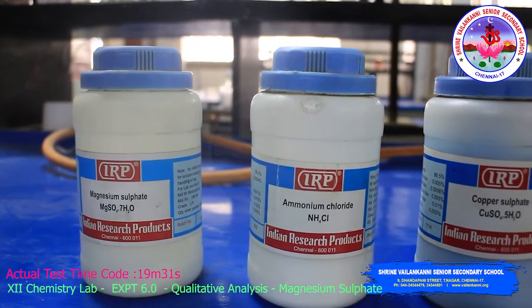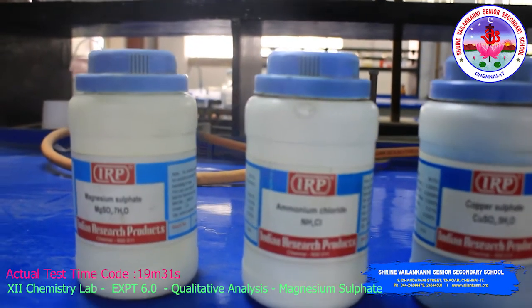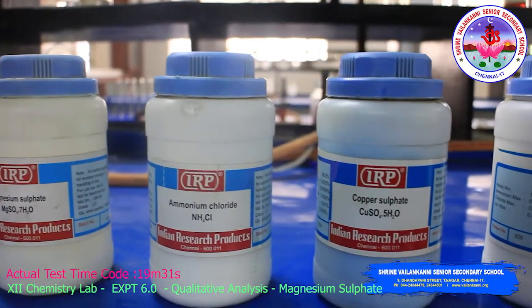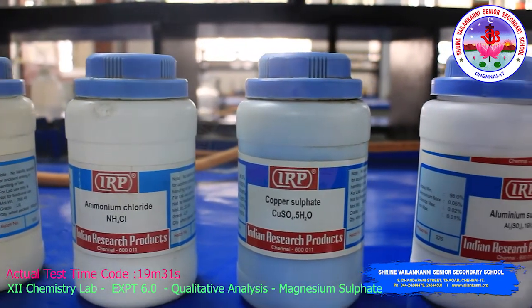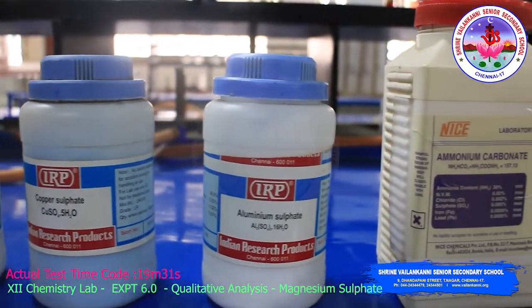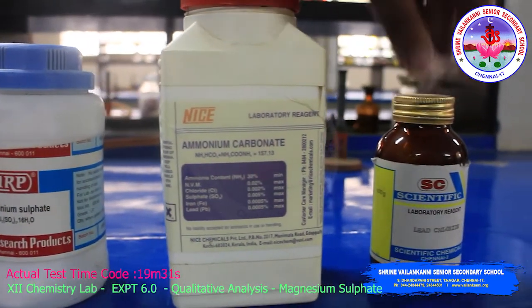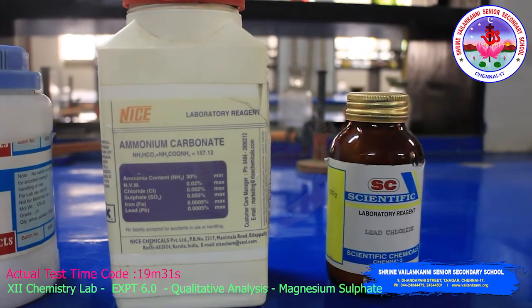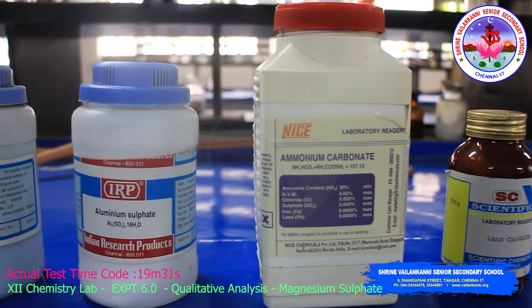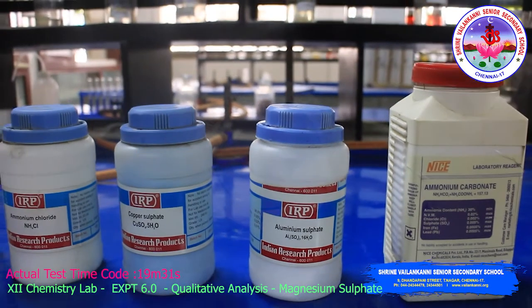Here I will show you the salts we are going to do this year: magnesium sulfate, ammonium chloride, copper sulfate, aluminium sulfate, ammonium carbonate, and lead chloride. These six salts we will do the confirmation tests for here, but you have to do the systematic procedure. I will show you the confirmation tests for these substances.